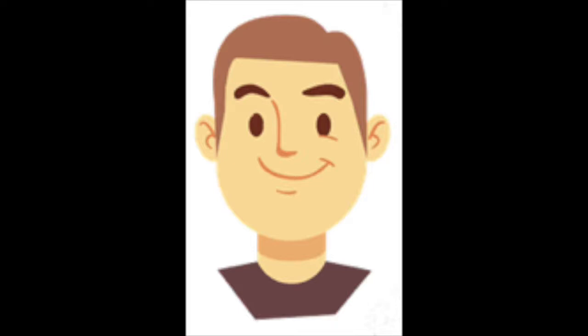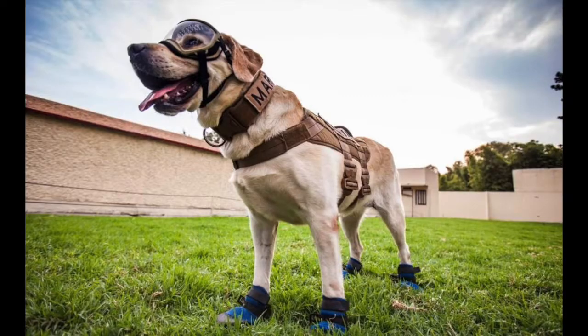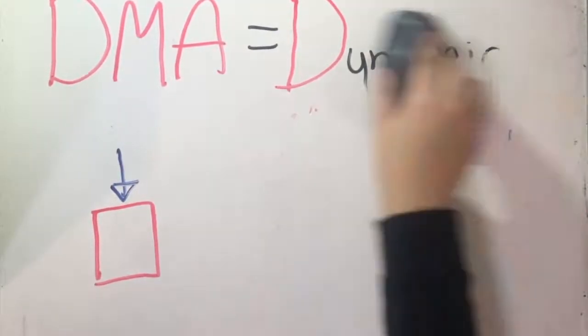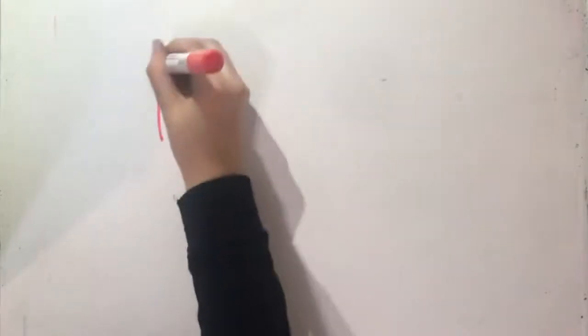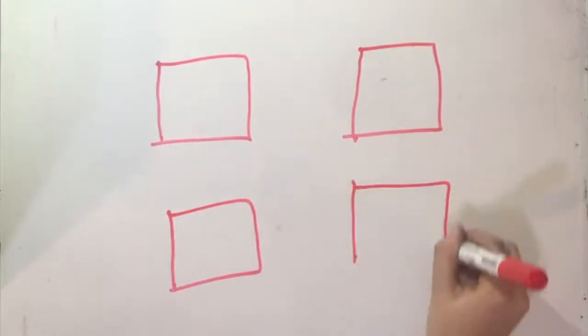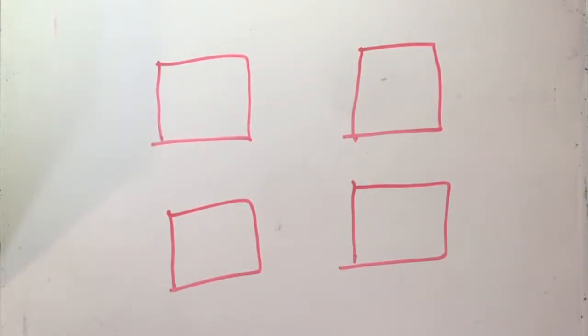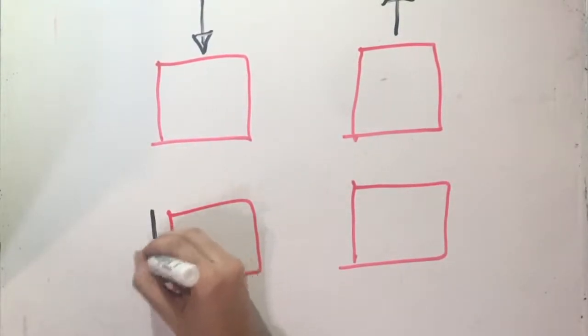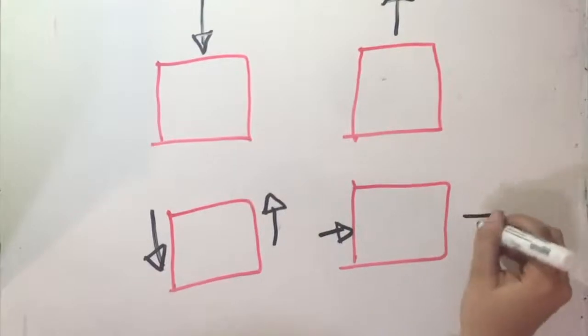What is the next characterization technique? If you are interested in analyzing the mechanical behavior of your polymer sample, you can use dynamic mechanical analysis or DMA. This is a technique that does a small deformation to the sample in order to determine the stress, elongation, frequency, and other parameters. These instruments allow you to do different kinds of tests by changing the geometries of the instrument's tip. You can do compressive, extension, shear, and flexure.